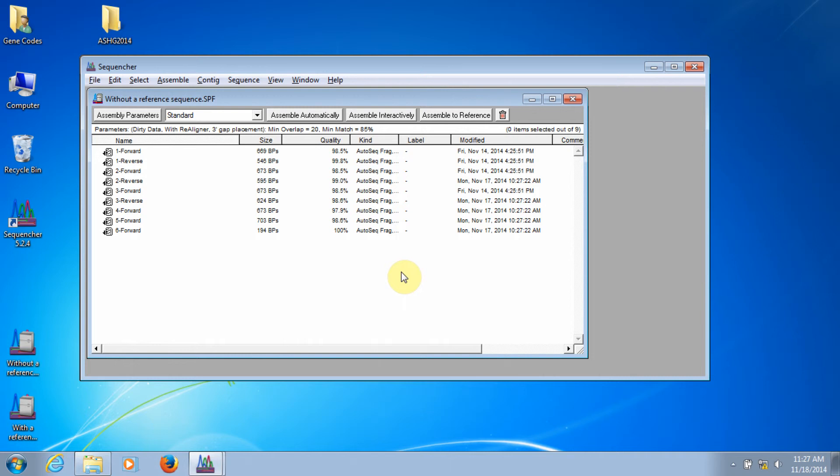In our previous installments, we looked at how to import data into Sequencher and how to trim low-quality data from the ends of your reads. The specific way you assemble a contig in Sequencher will depend on the type of data that you have. Here, we're going to focus on assembling with Sanger data with and without a reference sequence.